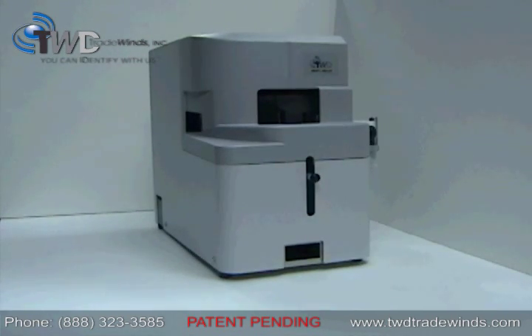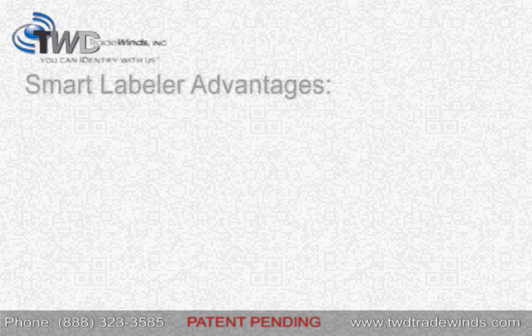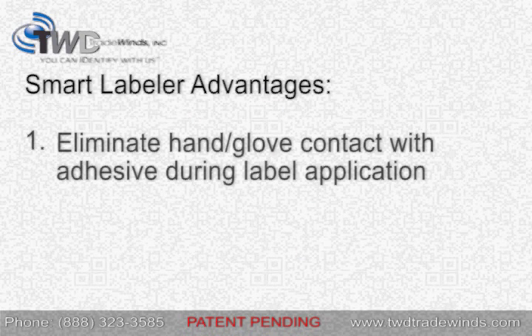Using the Smart Labeler instead of hand applying adhesive labels gives you several advantages. First, the Smart Labeler eliminates hand or glove contact with the adhesive during the application process. This avoids compromising the label's adhesion quality.